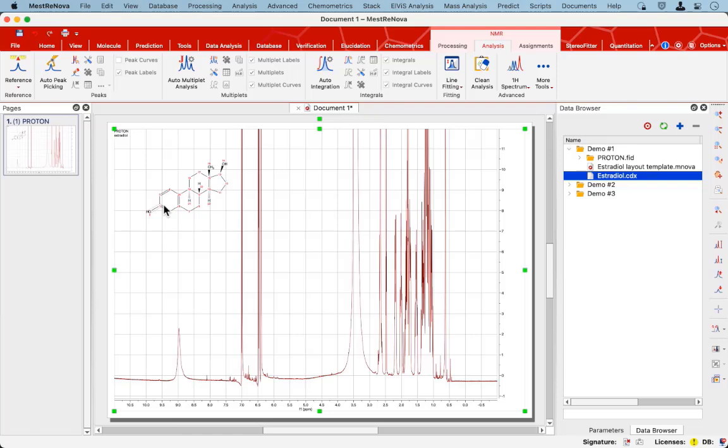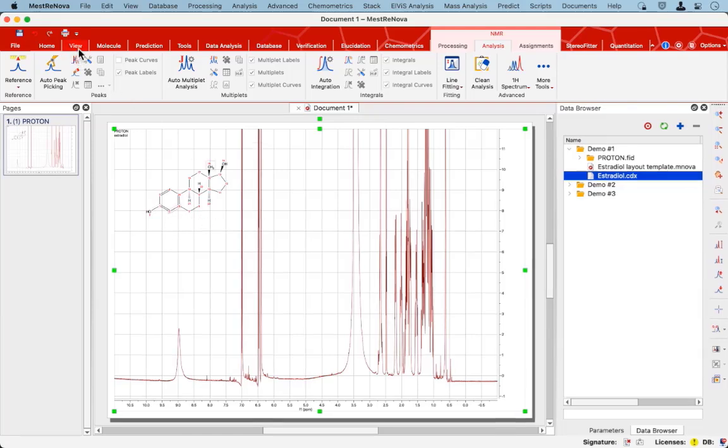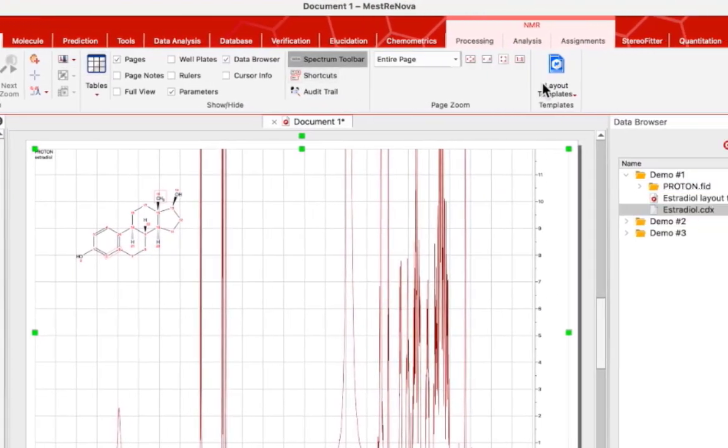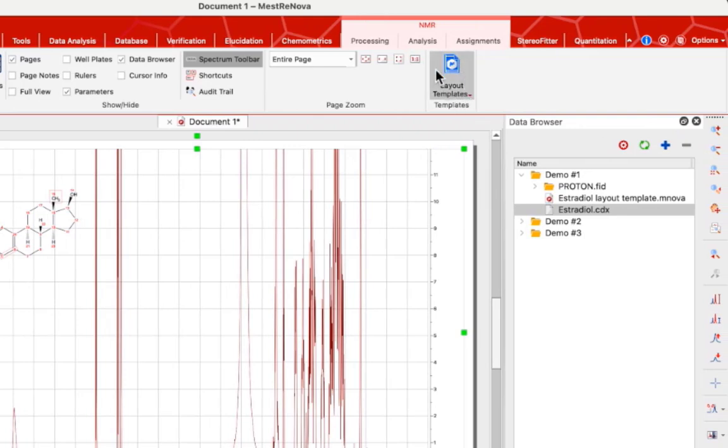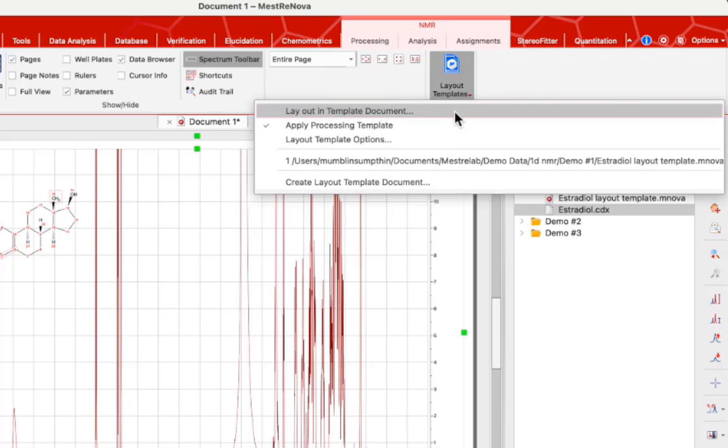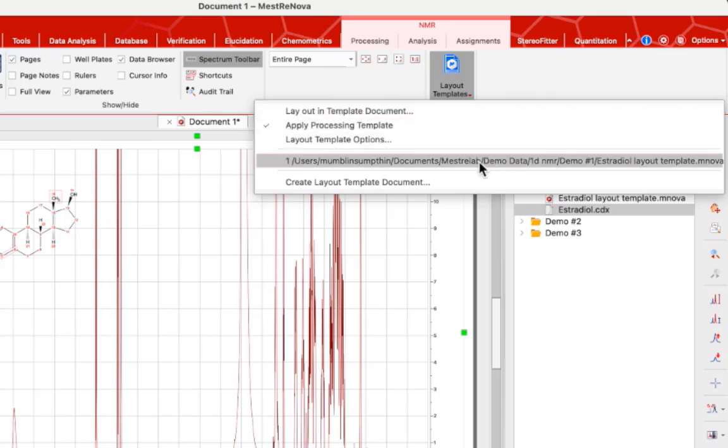Now to get to a report, I could go to the view menu. Over here on the right is the layout templates icon, and in there is a menu of options. I'm going to choose a layout template which has already been created.